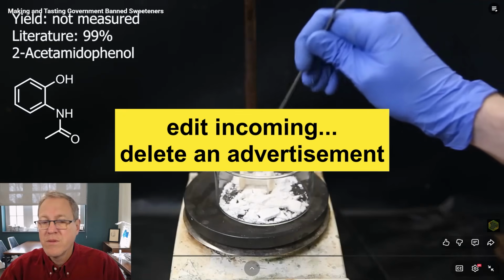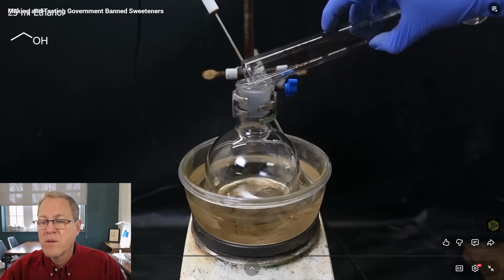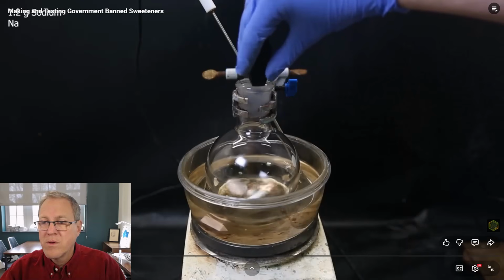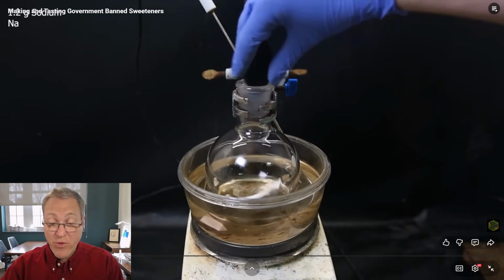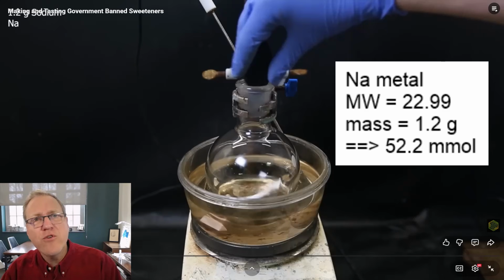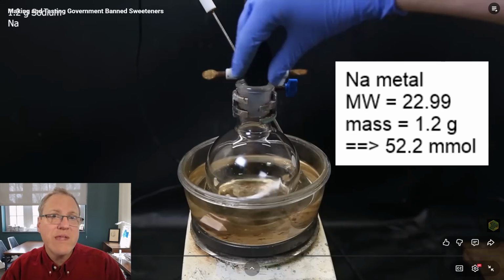I assume my yield is 100%. For the next reaction, I set up a flask with a stir bar in a glycerol bath. To that, I add 25 ml of ethanol as a solvent, and then 1.2 grams of sodium metal as a reactant. Okay, we're keeping score here. So that's 1.2 grams of sodium. That is 52.2 millimoles of sodium. So 52, if he has 47, that's about a 1-to-1 ratio, and that's about the minimum that he needs. He needs an equal molar amount.